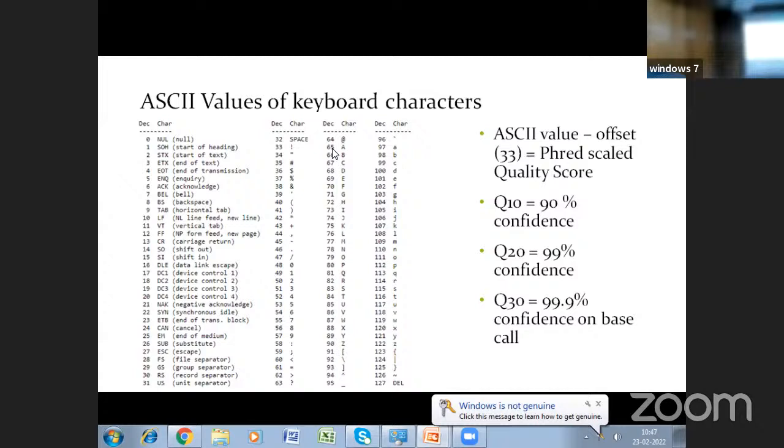If there are contaminants, for example you are taking DNA samples but there are contaminants, in every likelihood you will get these issues. Another thing is that the beginning and the end of the bases in a read are also likely to be of poor quality.